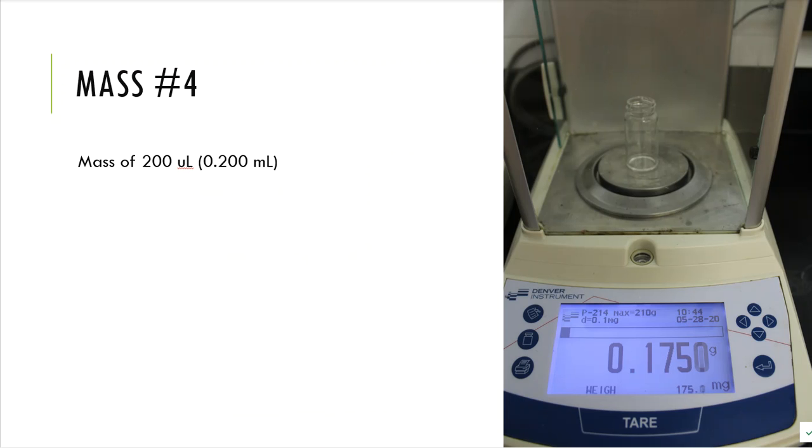All right, so I dispensed that into the container, and when I dispensed that into the container, my mass was 0.1750. So there's my first measurement. My first measurement probably did not match what the textbook told me to do. I just did whatever I wanted to do. It told me to measure out specific amounts of volumes. I said, whatever, I'll just do what I want to do as far as volume. It's the same process, though, but I've got the freedom and the flexibility to do that, and my data will still make sense.